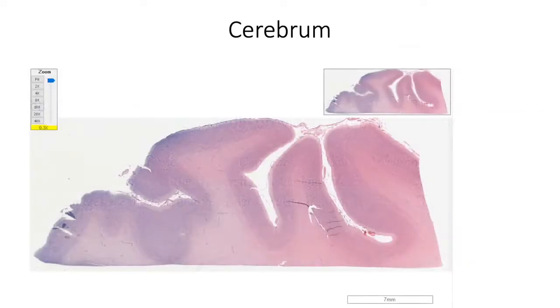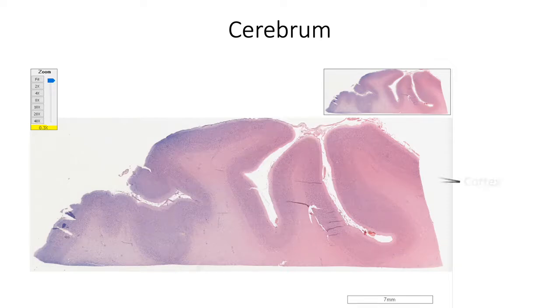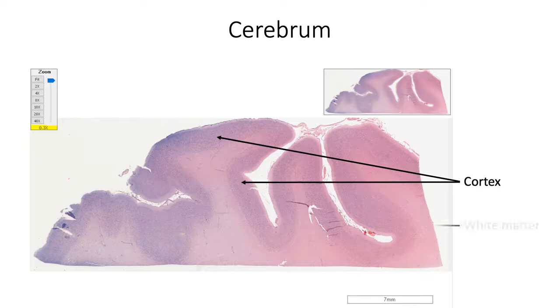Cerebral hemispheres are located in the supratentorial compartment of the cranial cavity. They are covered by 3 layers of meninges. Their surfaces show folding with elevations being known as gyri, separated by depressions known as sulci. Cerebral hemisphere has an outer cortex and an inner white matter containing basal nuclei at its depth.